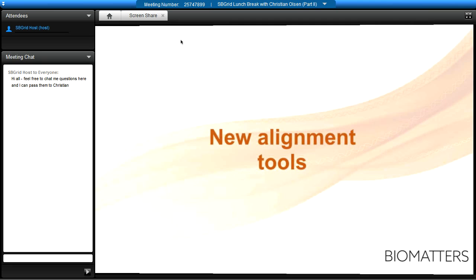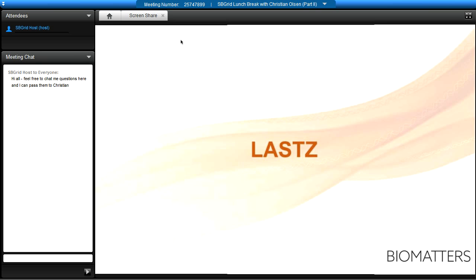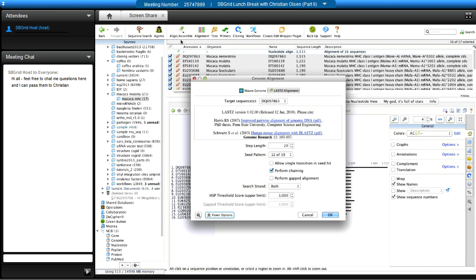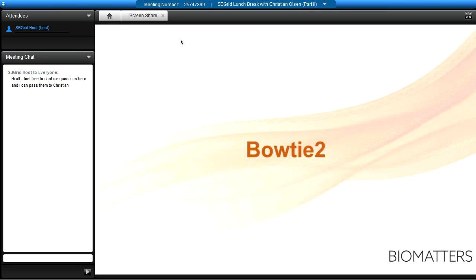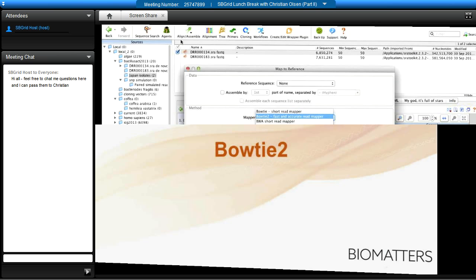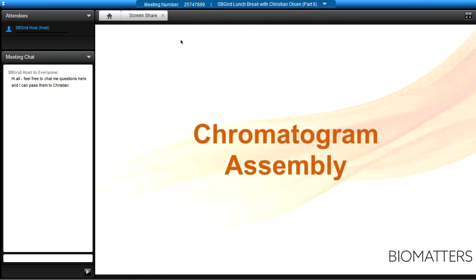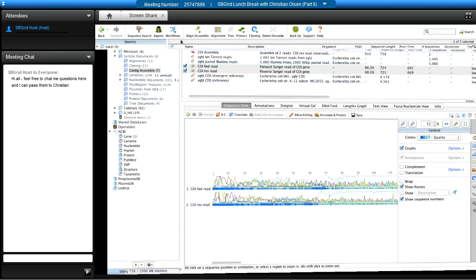There are new alignment tools in version 7. LASTZ is a whole-genome alignment method placed under 'Align Whole Genomes' in the align and assemble menu — a BLAST-like alignment tool. We've also included Bowtie 2 under the mapper menu for 'Map to Reference.' Many Geneious users are migrating from Sequencher, Lasergene, or Vector NTI; we've improved on those methods considerably for Sanger sequencing and cloning workflows.